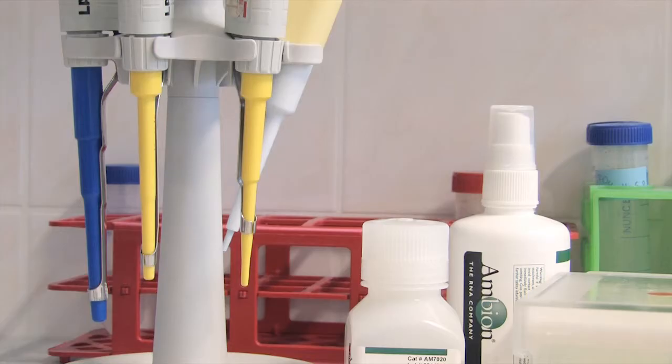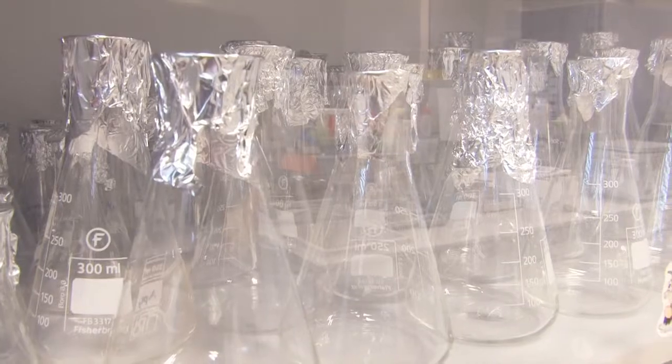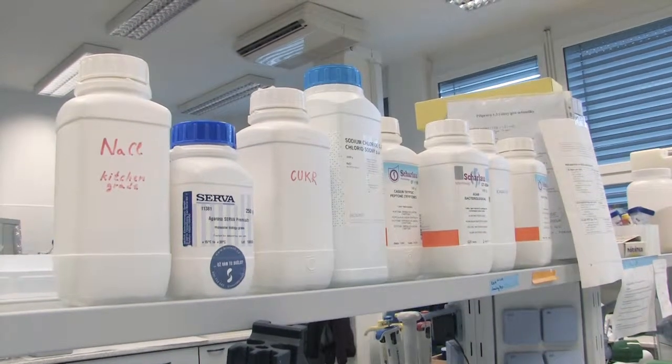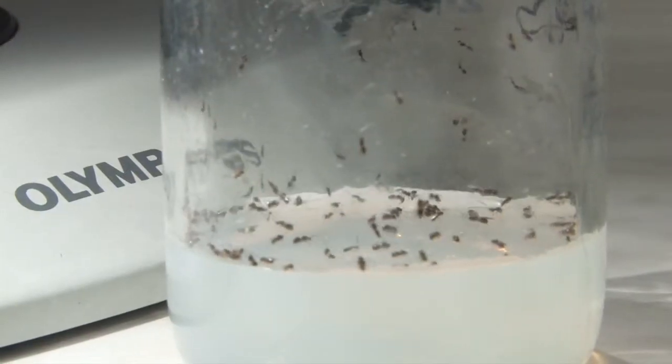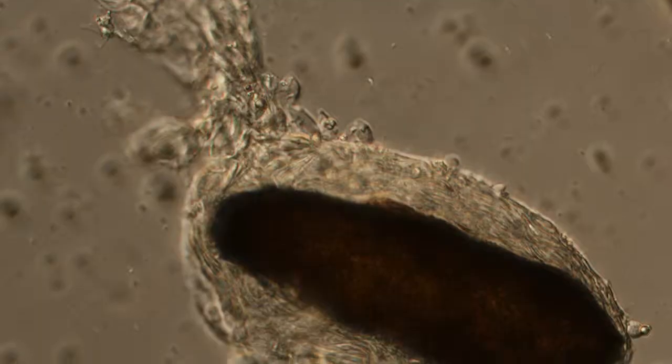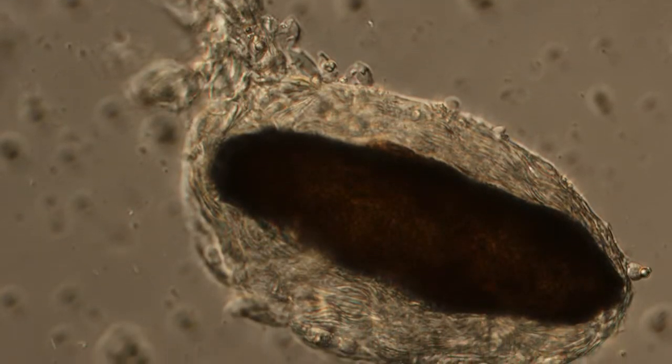So we decided to use again this Drosophila model to study this potential role of adenosine in the regulation of the energy. We are using different infections in Drosophila. For example, now we have in the lab these parasitic wasps, Leptopilina boulardi, which inject their eggs into the Drosophila larva. And that mounts a very strong, robust immune response in Drosophila. And that's a perfect model for us because we can actually study the immune response in the larvae which are normal and also in the larvae which are mutant, for example, in the adenosine receptor, and thus it blocks the adenosine signaling.